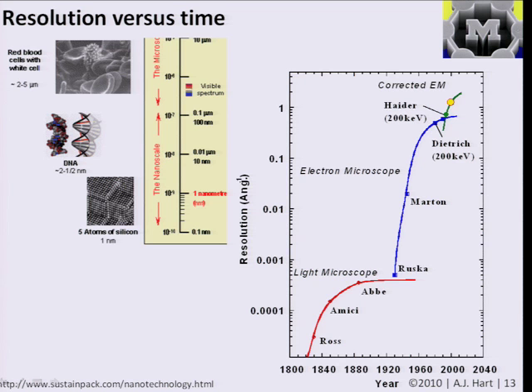And so you see that up until about 1920, the world was working on optical microscopy, and then we saturated at a fraction of a micron. And then the electron microscope was invented, and even still now we are advancing the resolution of electron microscopes, now by means of correcting the imperfections in electron images by understanding how the images form and how you can perfectly use magnetic fields to focus electrons, we can go even higher.